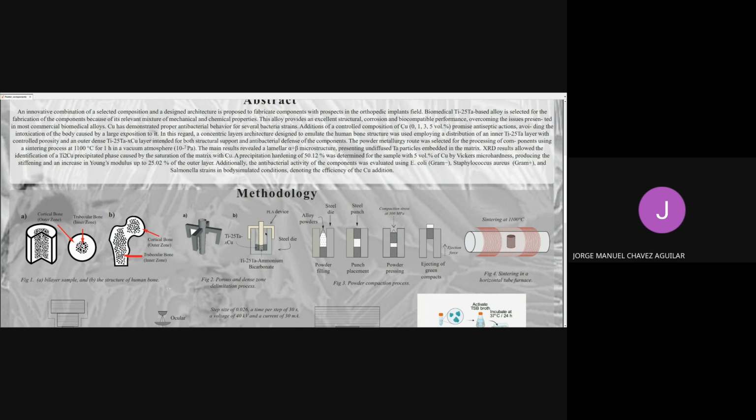After this step, we perform the compaction process to obtain the green compacts of the components, which were sintered in a vacuum atmosphere to prevent oxidation.